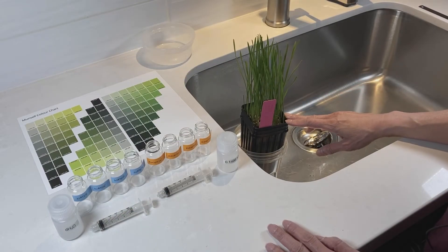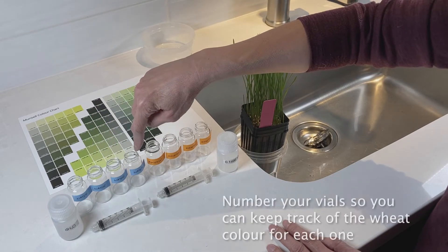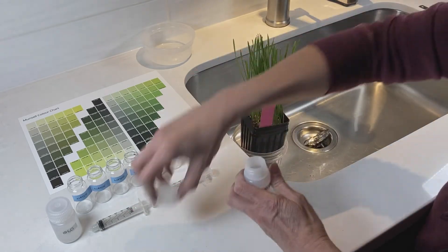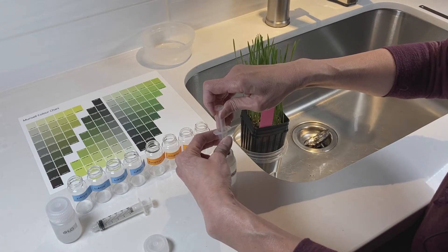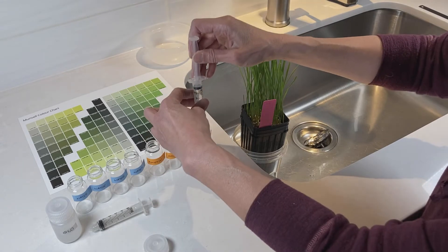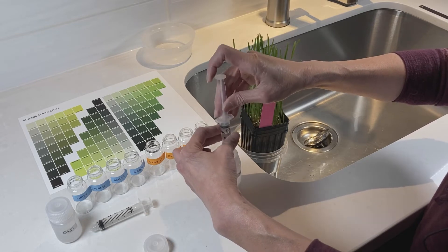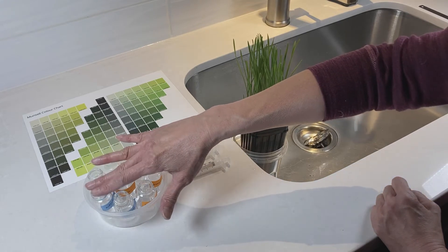This is the wheat part of the leaf senescence experiment. For this, you will need your pot of one-week-old wheat seedlings, your Munsell color chart, four vials labeled for water and four vials labeled for kinetin, your water bottle, your kinetin solution, and the two syringes from your kit. Start by filling these vials with the solution. Use your five mil syringe and put five milliliters in every vial — pull it up so the fluid is level with the five milliliter mark, then put it into your vial. Do this for your kinetin solution and for your water vials. You should now have vials with five mils of kinetin and five mils of water in each vial as labeled.